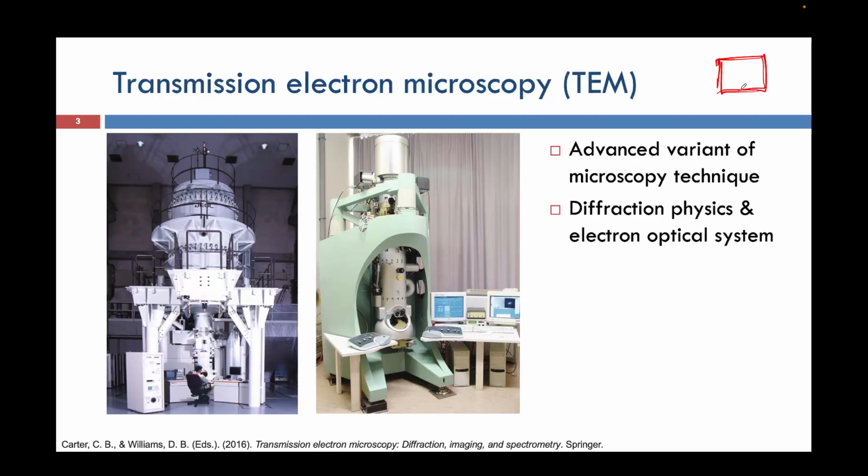So that means more and more materials are going inside a chip, and we need to see what the features are, how they are behaving, and how they are performing under specific conditions. So we need to resolve the distance between the atoms of those materials. And when we are talking about resolving the distance between atoms, that's why we are using this transmission electron microscopy.